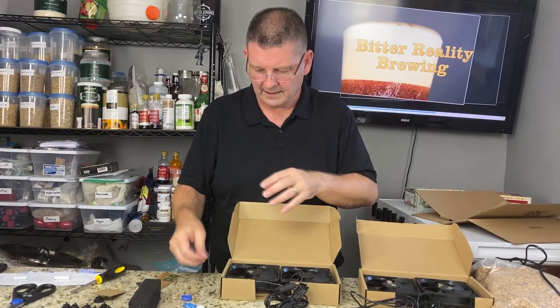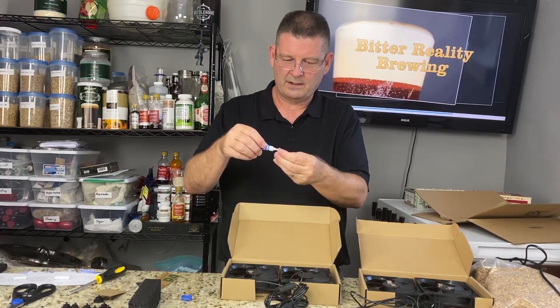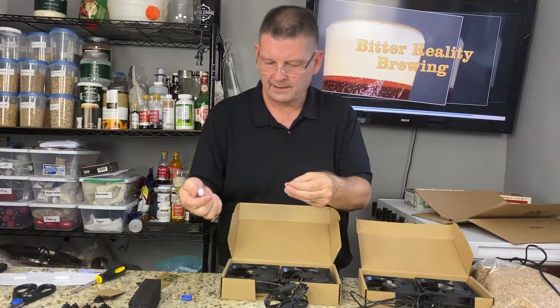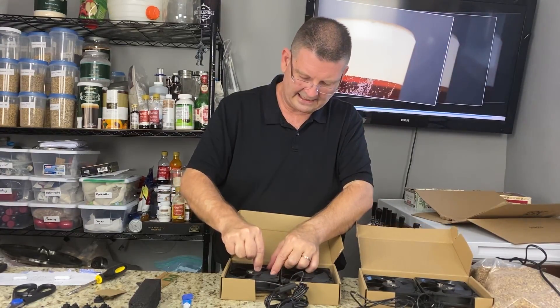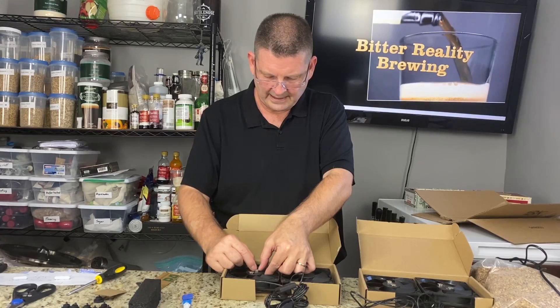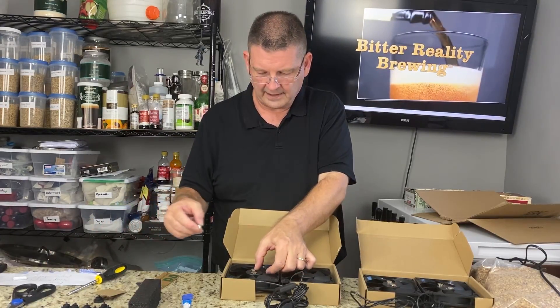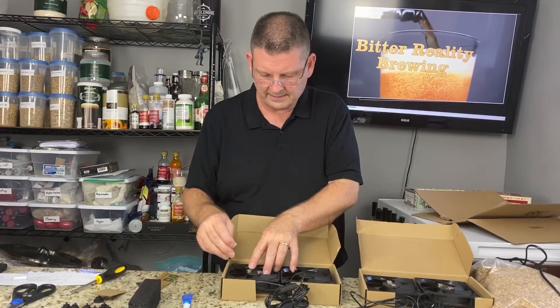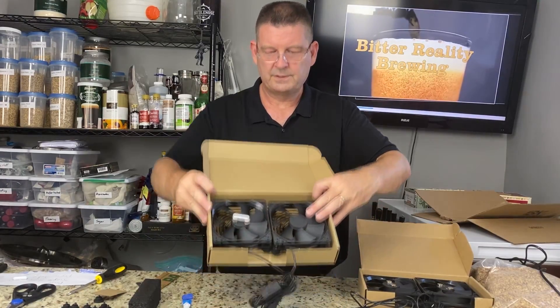Of course I got a little bit on my finger, but not so bad. Without flipping it over, remember which side is the top — flip it over knowing that's going to be the bottom, put super glue on there, hopefully enough but not too much. You want to go exactly on the total opposite side. Hold it there for usually about 15 seconds, sometimes 30, until it dries just enough that it's not going to go flying. Your fan may want to move and that's okay.